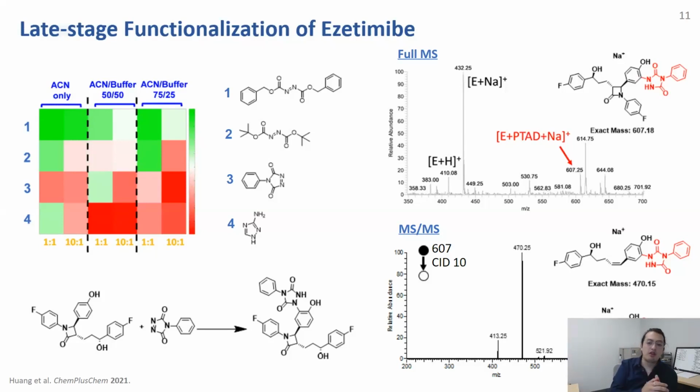and then acquire MS/MS data with that same little amount of sample that you put in. And I think I forgot to mention, but the pin tool that we use is calibrated for 50 nanoliters. So we're using 50 nanoliter samples to perform the analysis that typically translate to low nanograms down to picograms or even lower of sample, with very, very good results because it allows you to both do full MS and do MS/MS.